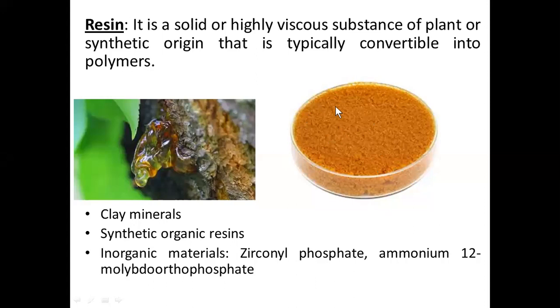And this is a man-made resin. As I told you, a variety of brands of man-made resins are available, and these are also called synthetic resins. Even clay minerals, which are available in your villages, hill areas, or lands, are made by silica. These silica particles may be modified naturally, or we can modify these naturally available clay minerals to any extent in order to get the required resin.